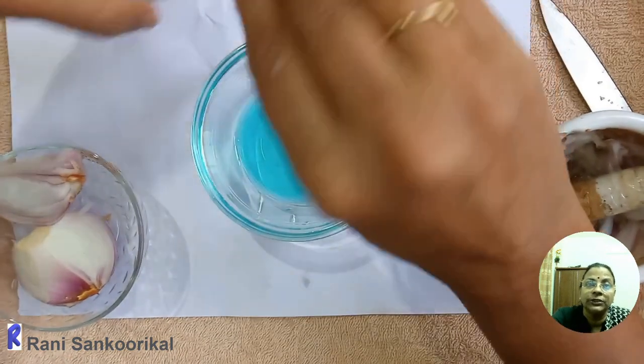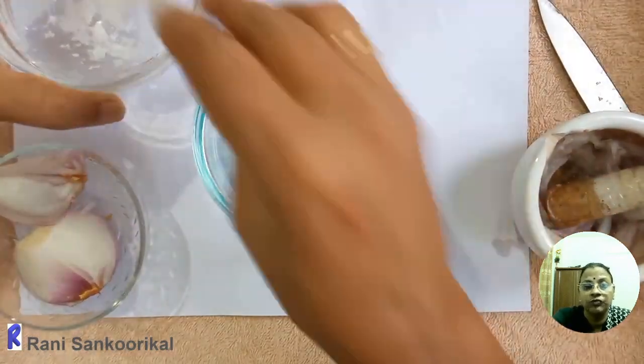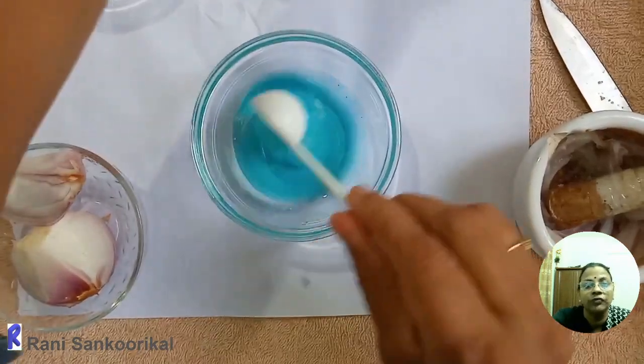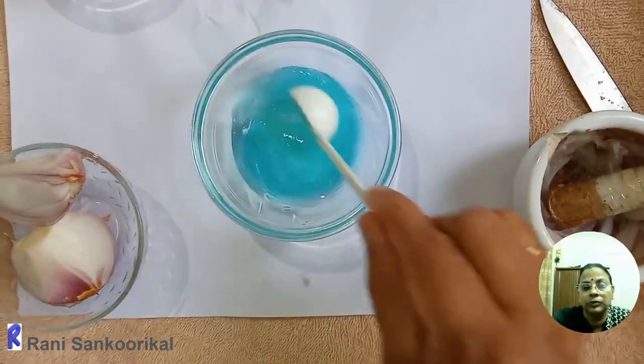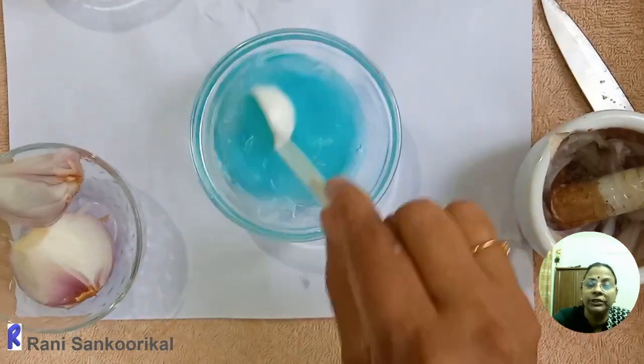Then after crushing, you have to take the liquid detergent, that is 1 or 2 spoonful of liquid detergent. To that you have to add half a spoon of common salt and stir it well. To that you can add 25 ml of water.